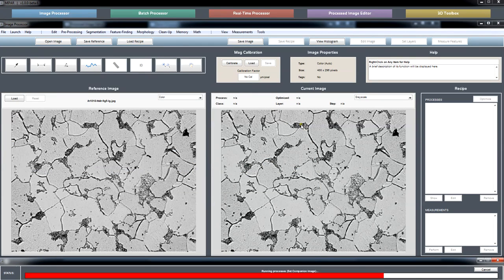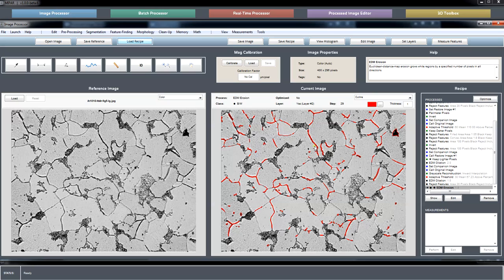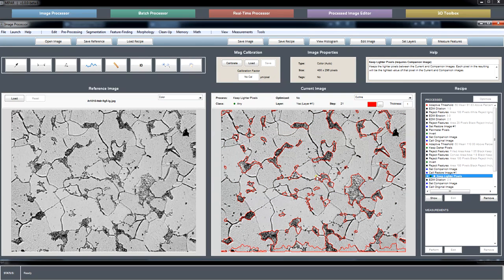And here's another case where you just have to consider what makes the features different and pick steps to go after that. So this was one layer here and another layer that had these stringers here along the boundaries. Or these strange clusters. To be honest, I'm not used to seeing this mess here along the bottom.